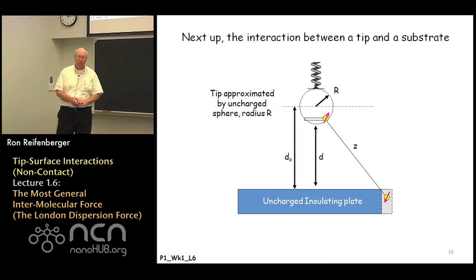We're going to use that to actually calculate the net interaction force between a tip that's suspended a distance d above a substrate. And we're going to do that calculation by summing up all the individual interactions between atoms in the tip and atoms in the substrate, sort of as I've schematically indicated in this particular slide.